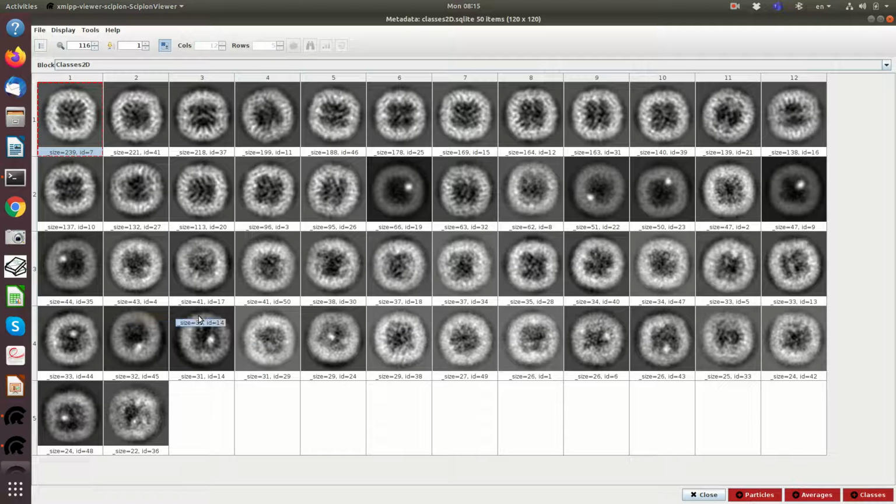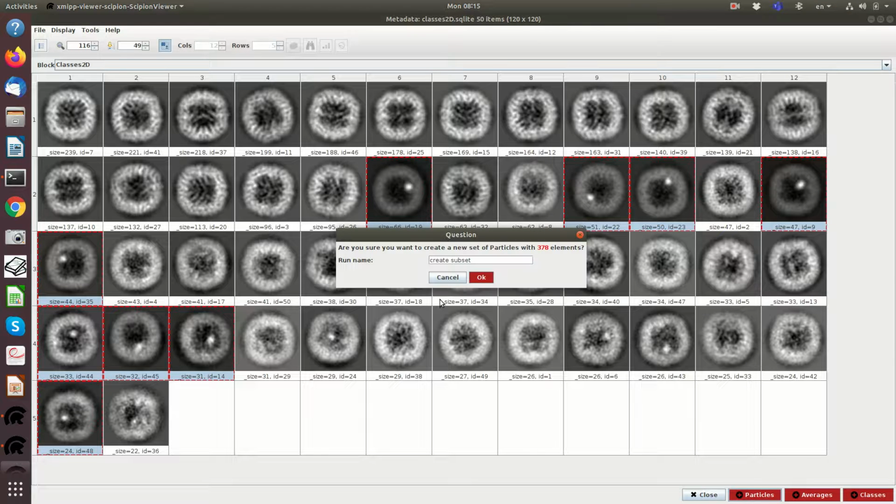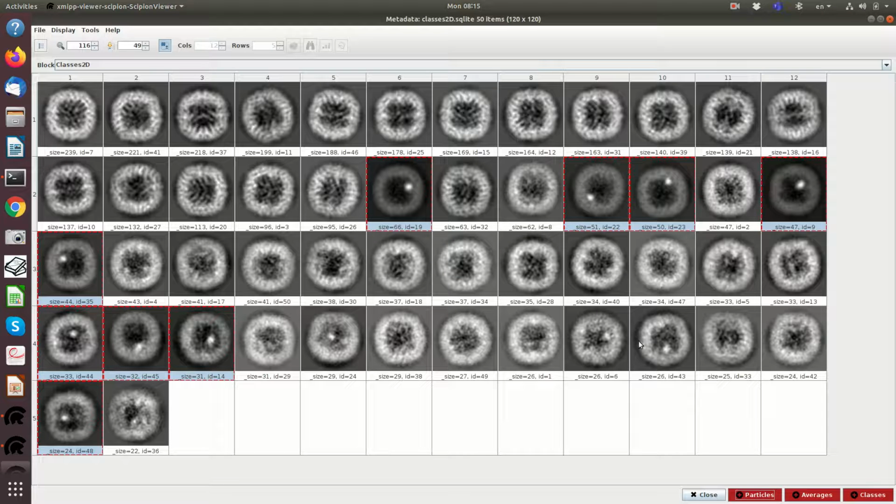And we can also see that this is ferritin, apoferritin. Apo means without iron. But some of the particles still have the iron inside, not so many. We see that the amount of particles with iron, out of almost 3,000, is 300. So it is about 10% of the particles that still had the iron inside, maybe these ones too.